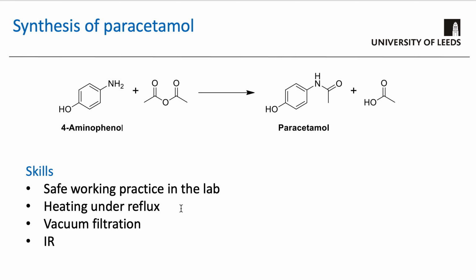You're going to be using vacuum filtration, which is a form of filtration, but it's much quicker and more commonly used than a simple gravity filtration. And then you're going to be using IR spectroscopy again, this time to confirm that you've got the correct structure of paracetamol, but also that your sample is pure, and that it's dry as well.